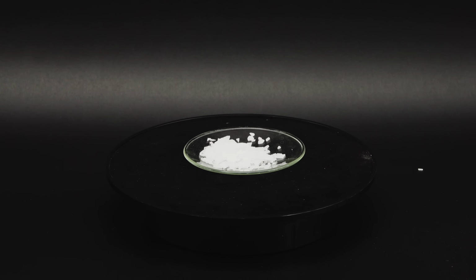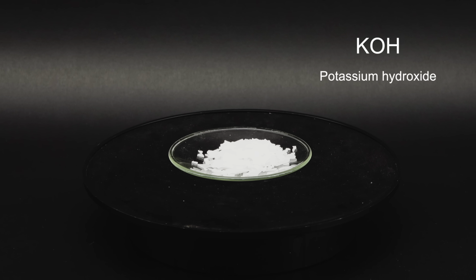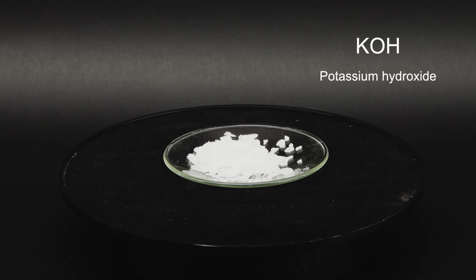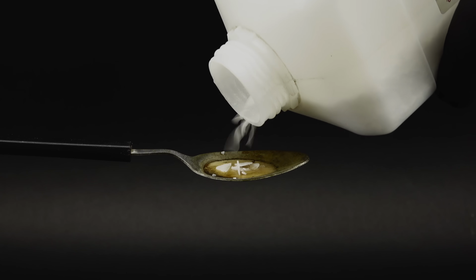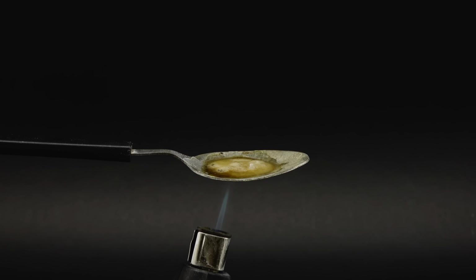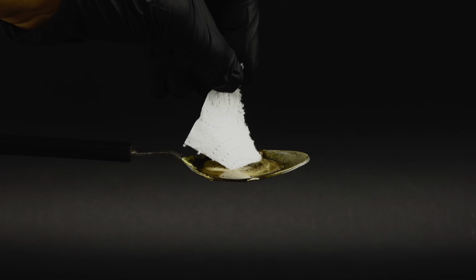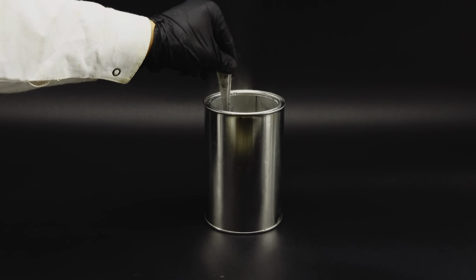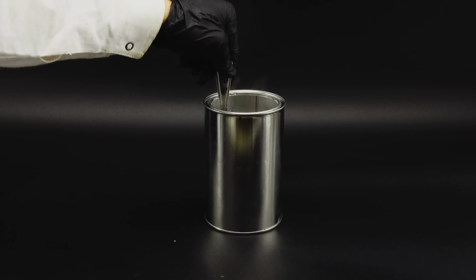Fortunately, after some research, I found that you can have molten hydroxide at much lower temperatures, and what makes it possible is this little goober right here called potassium hydroxide. Now, it is an even stronger and more corrosive base than sodium hydroxide. It also has an even higher melting point, which honestly doesn't make it seem that useful. When mixed with sodium hydroxide in the right ratio, however, the two create something called a eutectic mixture, which, while retaining all their corrosiveness, melts at only 170 degrees Celsius. This is kind of huge for me, as it would both make the reaction much easier and potentially higher yielding, and I was really eager to try it out.